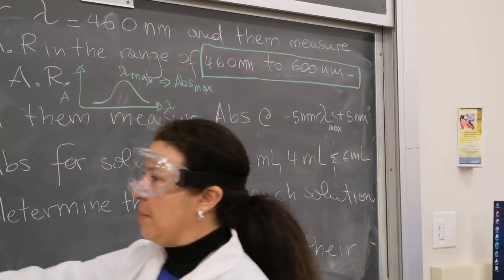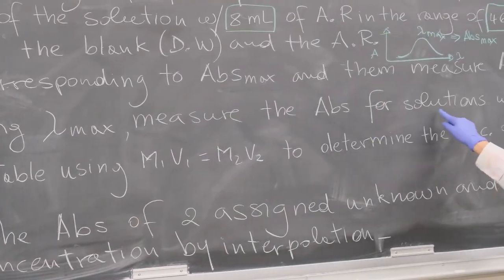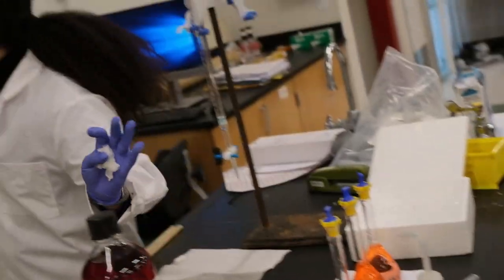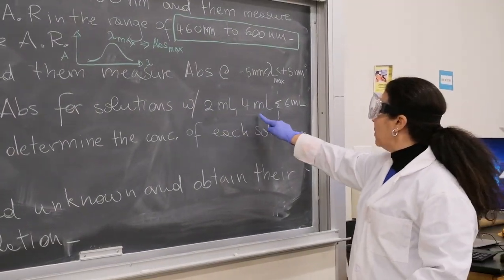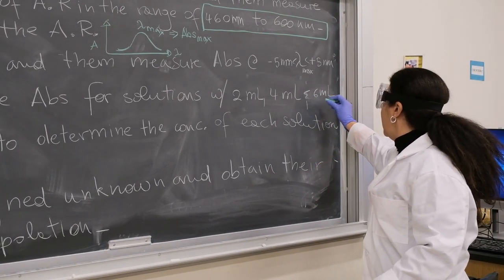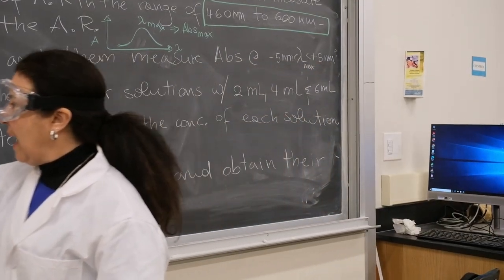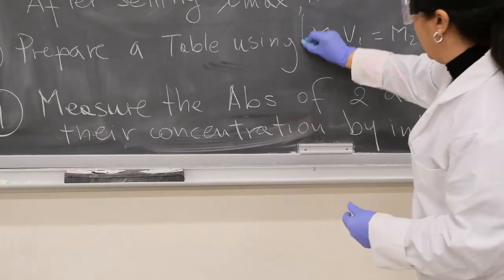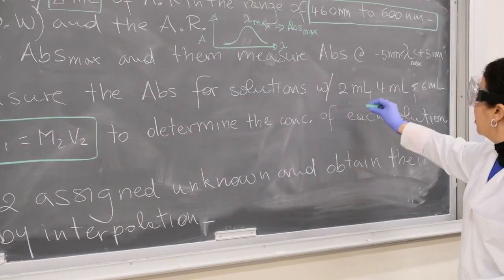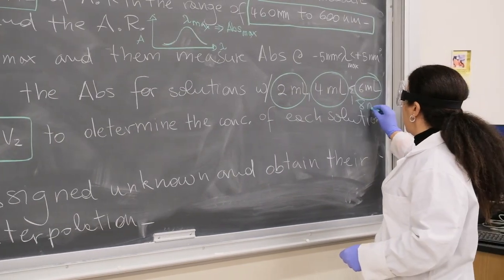Once you set up the lambda max in your instrument, you measure the absorbance for the solutions that you prepared, the other three solutions here, the one at 2 milliliters Allura red, the one at 4 milliliters, and the one at 6 milliliters. The one at 8 milliliters you already used for the calibration, so you don't need to do it. You prepare a table using this equation, M1V1 equals M2V2, to determine the concentration of the Allura red corresponding to each of these solutions, including the 8 milliliters.